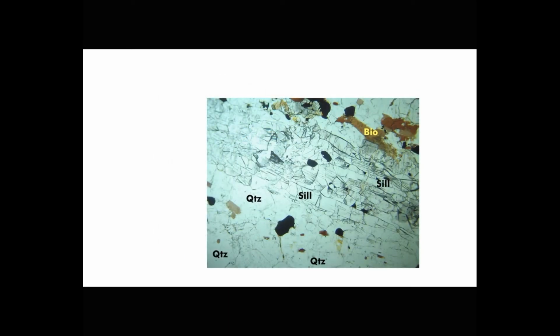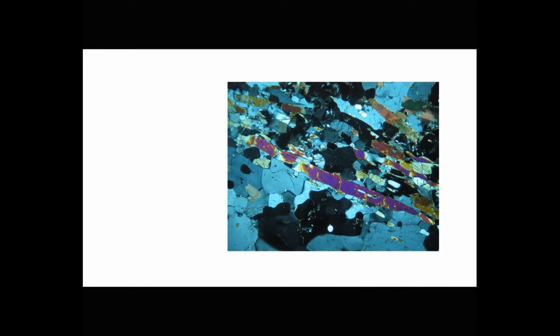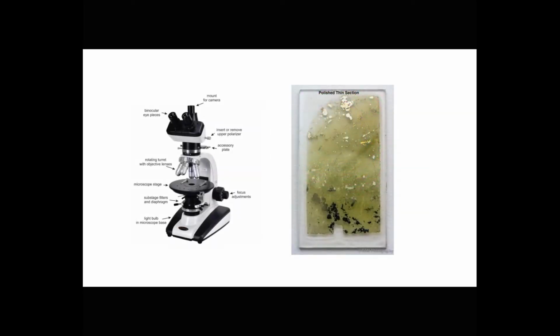As an introduction to optical mineralogy, this video starts first with rocks in outcrop and in fist-size rock specimens. And then we show how to make them into thin sections. And we finish the video by discussing how we examine those thin sections using a petrographic microscope. However, we leave the details of optical theory and of thin section examination for another time.